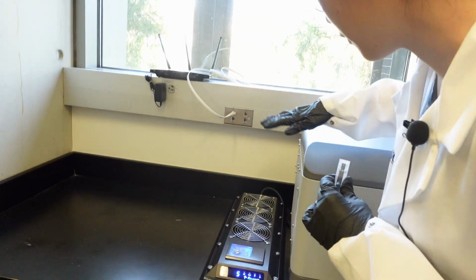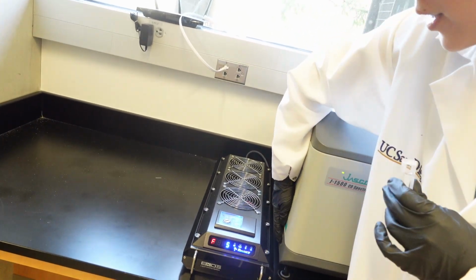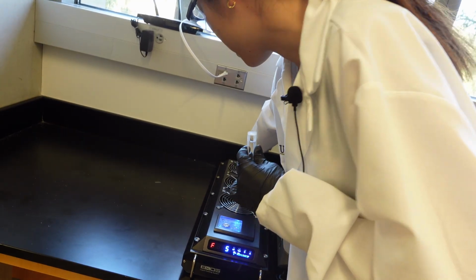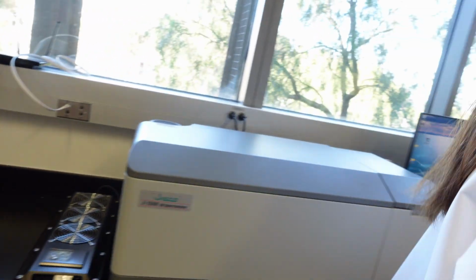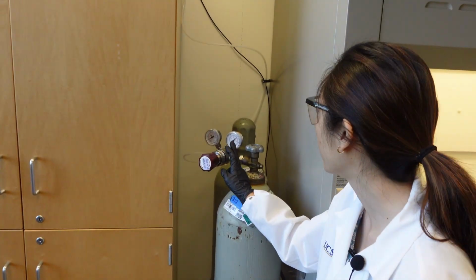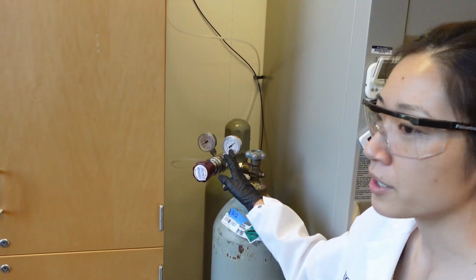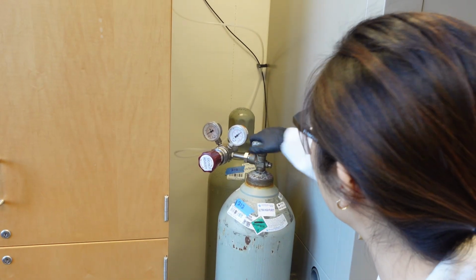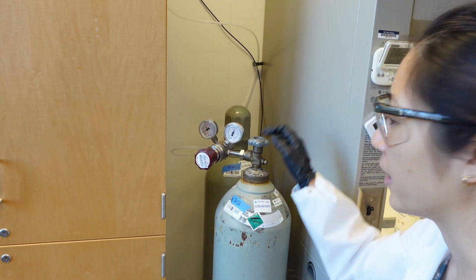And then next we'll turn off first the instrument, and then we'll turn off the cooling feature. And then we'll go over here. We'll want to record the final value of our pressure. Make sure you put that into the logbook. And then when you're done, you can go ahead and close this. And then you're all good.